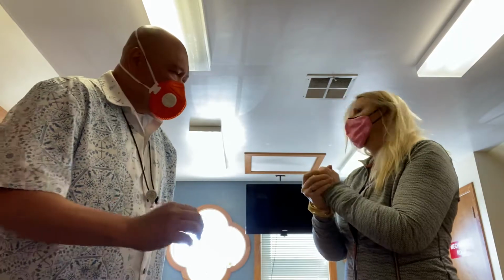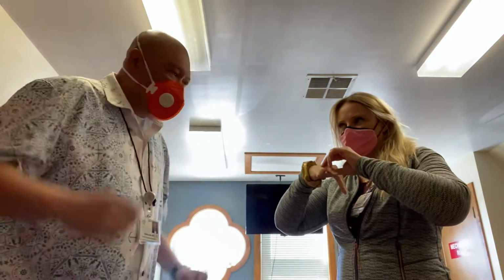So Elizabeth will do hand sanitizing. Then the next step that I want to make sure is every jewelry, any watches, anything, the hair needs to be put up. So she'll do that.